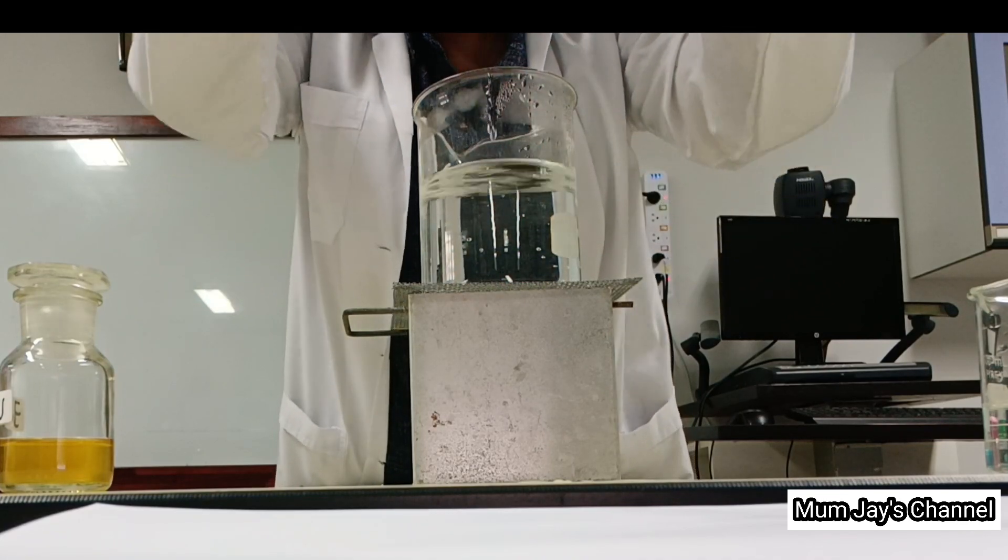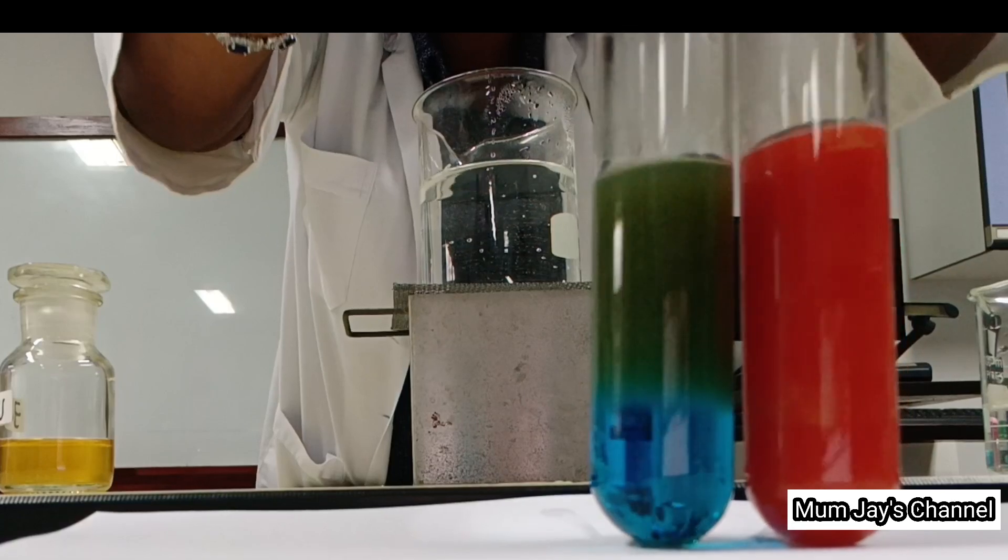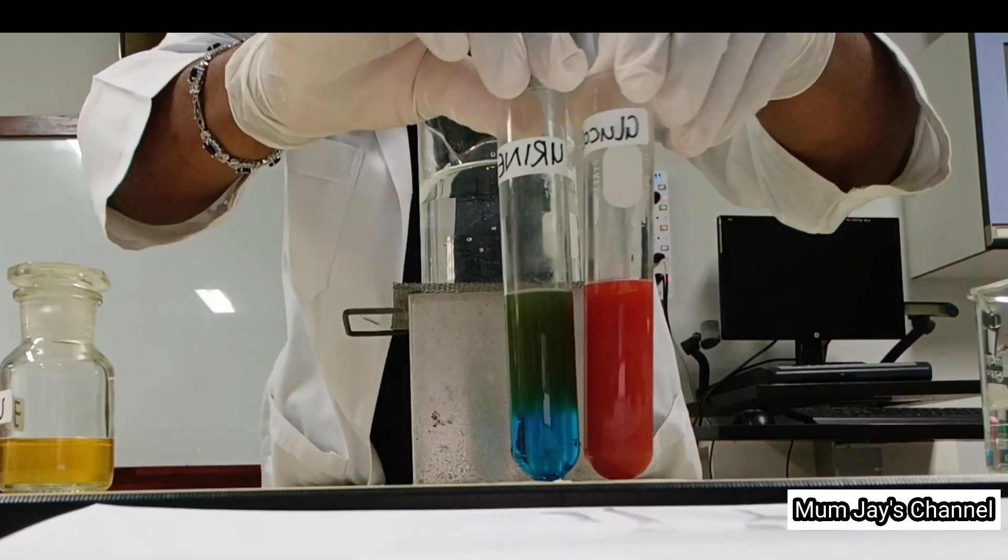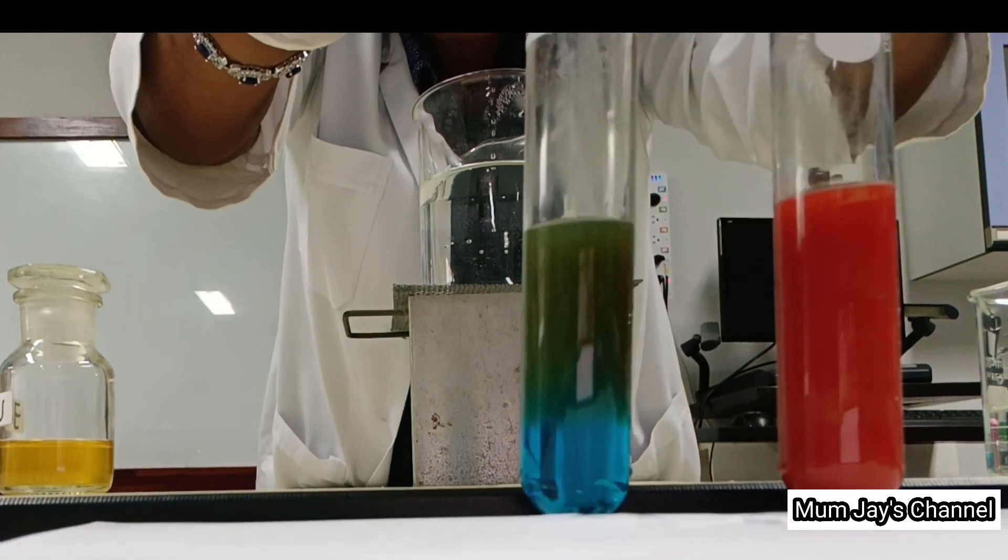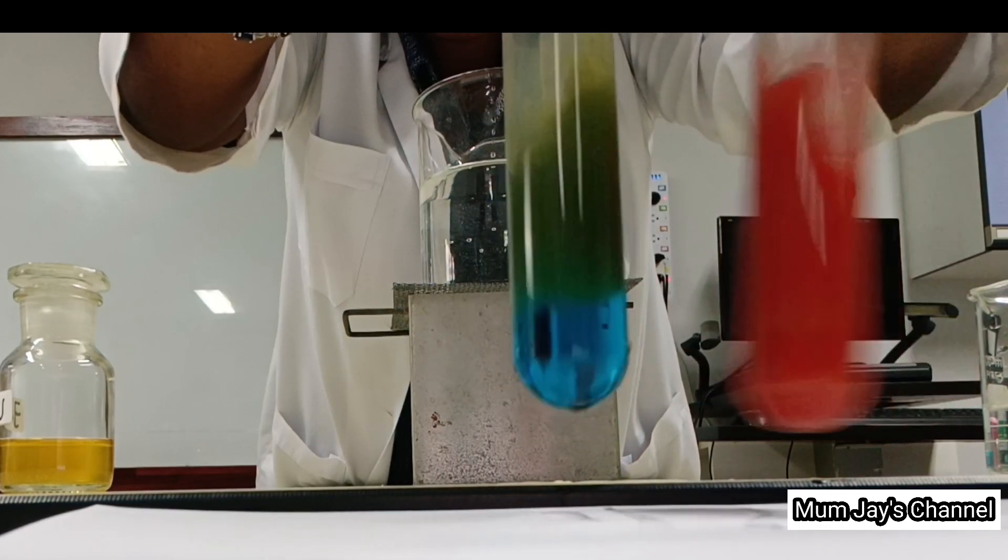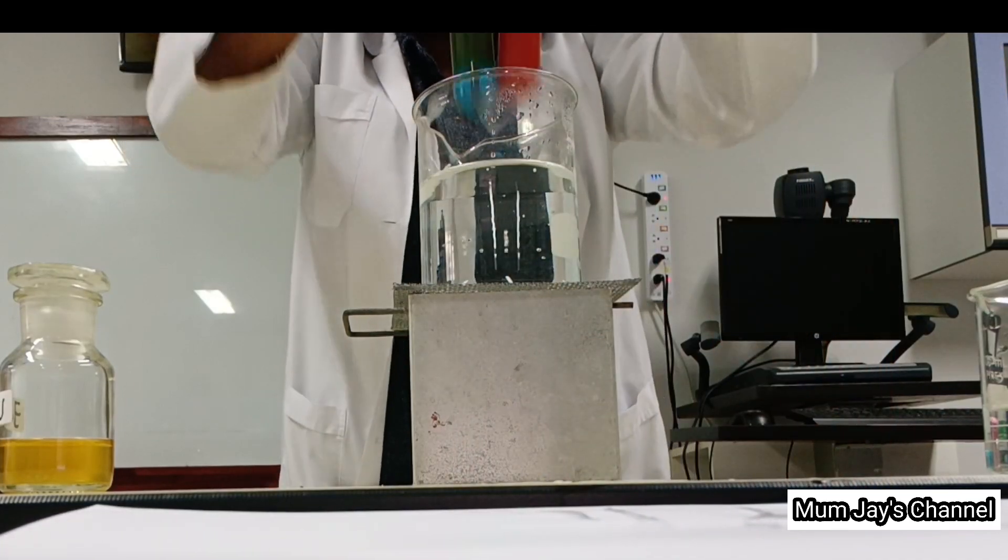Remove from the heat and allow your mixture to cool slowly. A blue color indicates the absence of sugar, while a green color indicates traces of sugar, and the brick red means that there is a lot of sugar present in the sample.